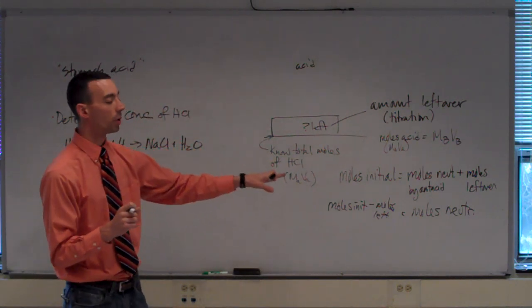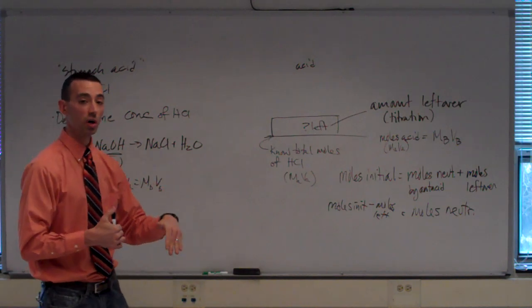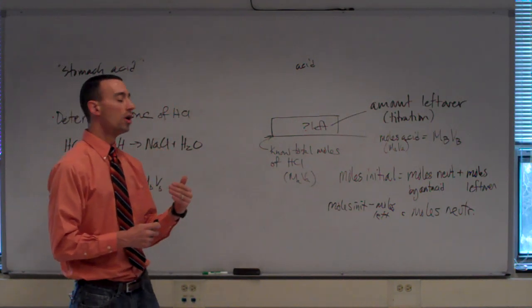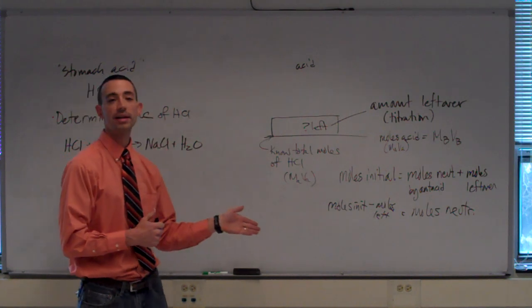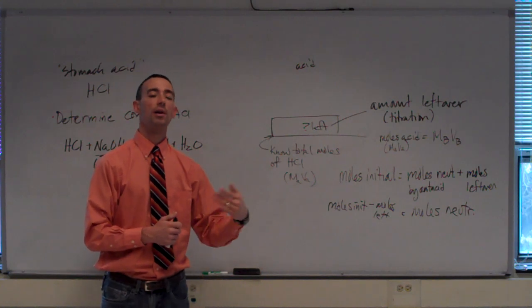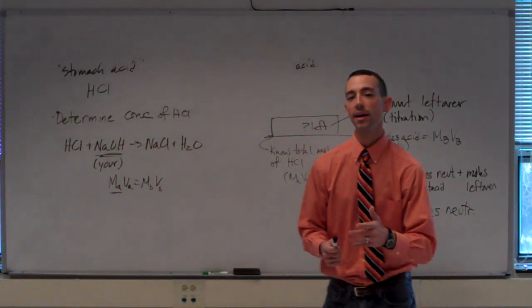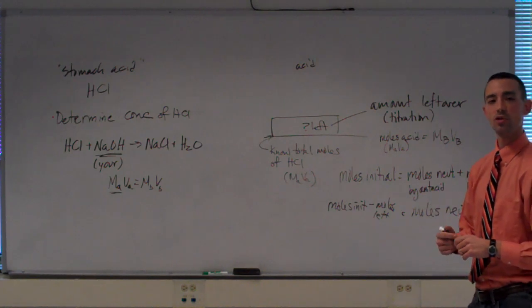Ultimately, you'll take this moles neutralized and turn it into moles per dose by scaling up or down for the correct number of tablets or teaspoons per dose. And then you'll convert to moles per dollar the same way we did in the pre-lab: how many tablets or teaspoons are in the package, and what was the cost of the package. In the end, you'll be able to compare your theoretical moles per dollar to your experimental moles per dollar.